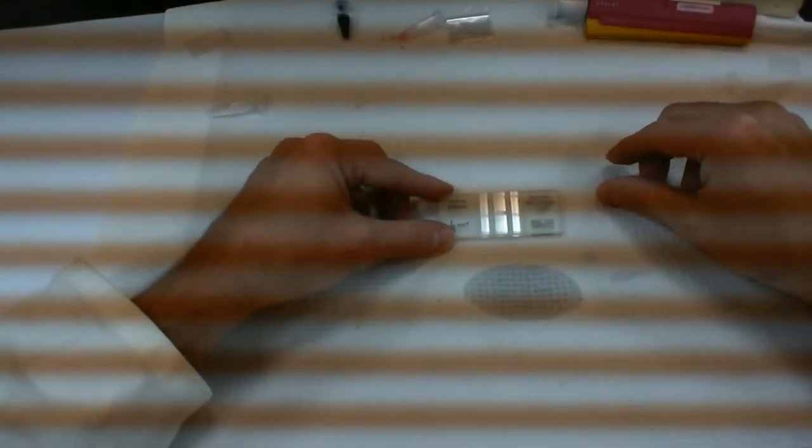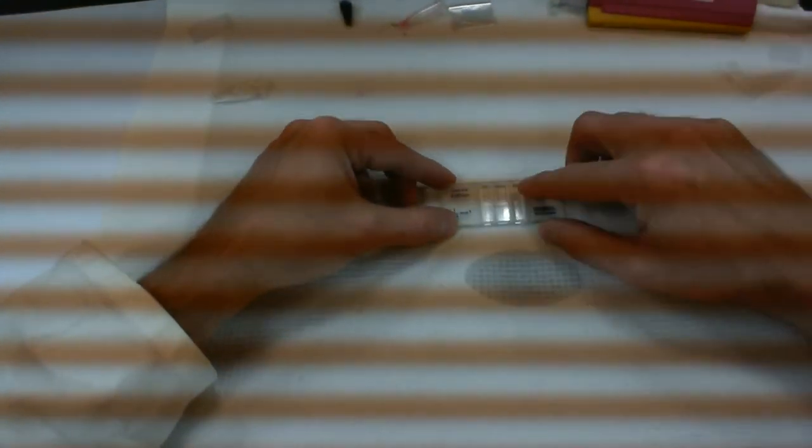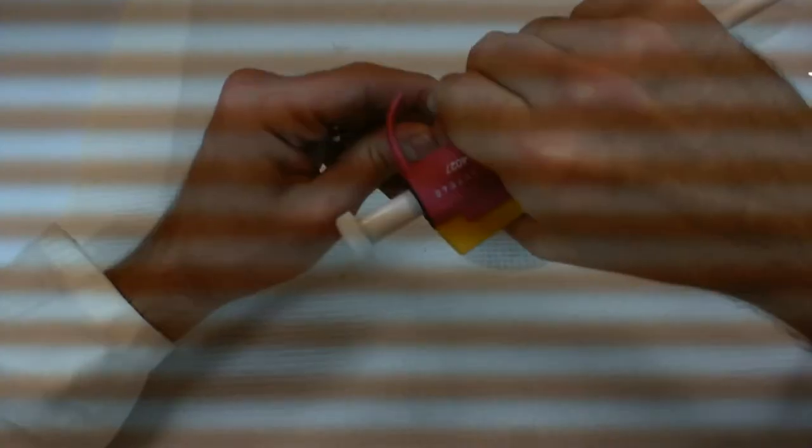And so here's what you do. You want to add some moisture to the shoulders of the counting chamber. So what I'm going to do is take a P10 in this case. I'm just going to add a little bit of water to each side. So there we go. How much? Doesn't really matter. I'm going to put in about 1 to 2 microliters.